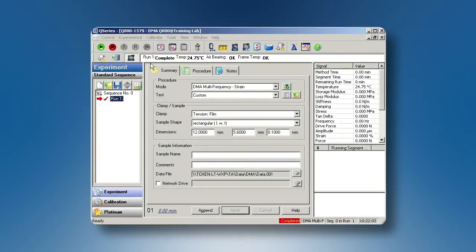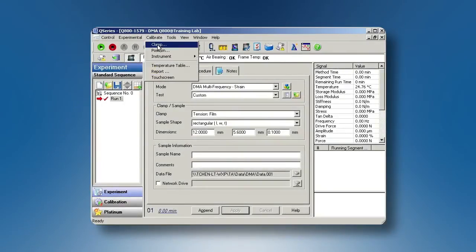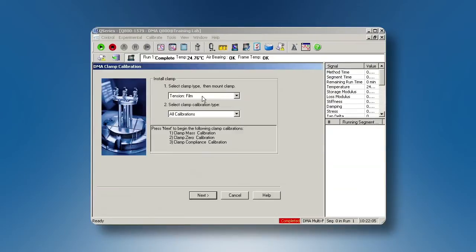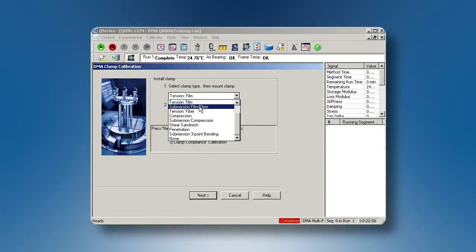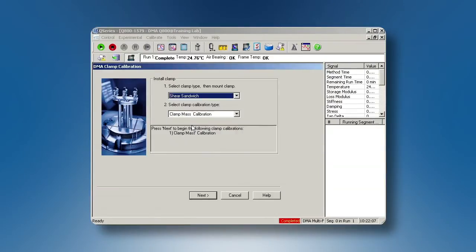From the control software, go to Calibrate, Clamp, choose Shear Sandwich, Next.